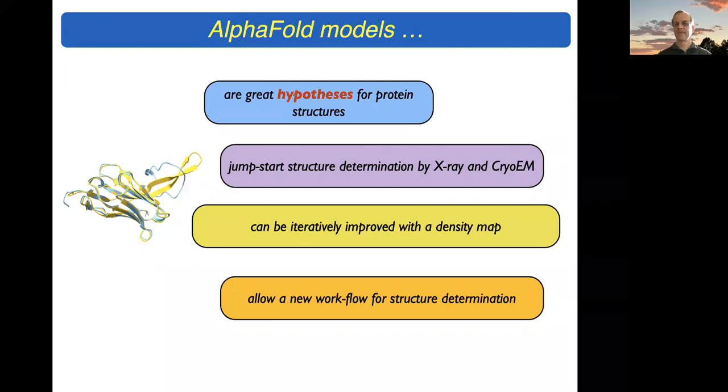Do you think there is a limit on the size of the sequence which can be used for prediction? Currently the limits on size have to do with memory requirements for running these programs. If you run AlphaFold online with the Colab, you can get things up to about 1,200 residues. Beyond that, you start running out of memory that's available to you. If you have your own GPU, you can do bigger structures, but it's still not unlimited.